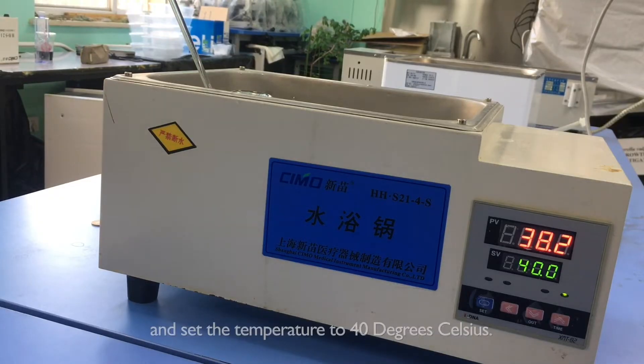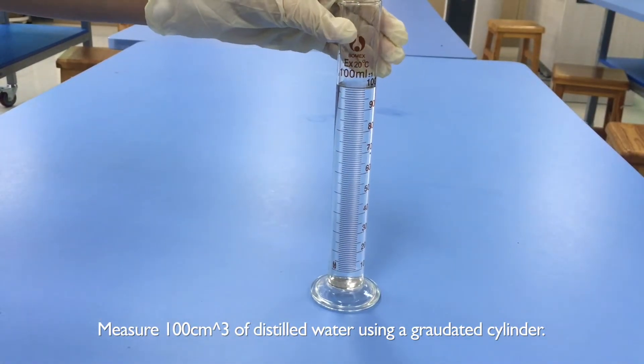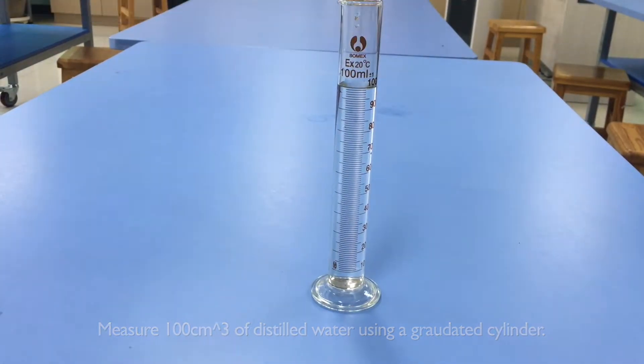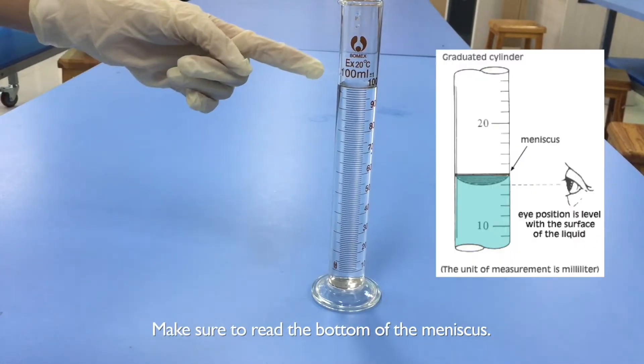Pour water into a water bath and set the temperature to 40 degrees Celsius. Measure 100 cubic centimeters of distilled water using a graduated cylinder. Make sure to read the bottom of the meniscus.